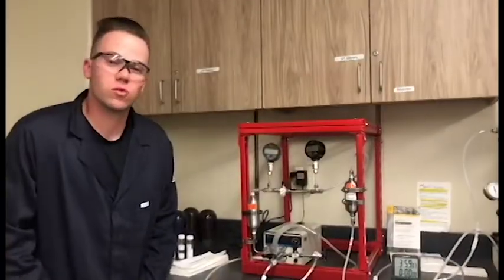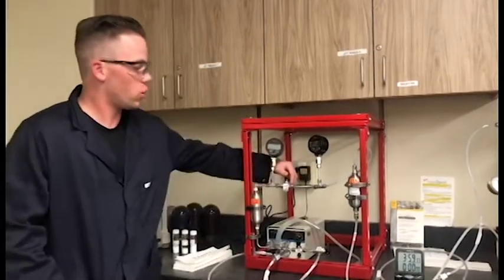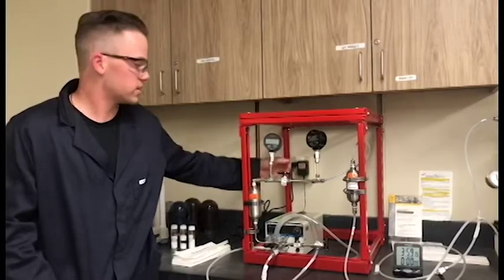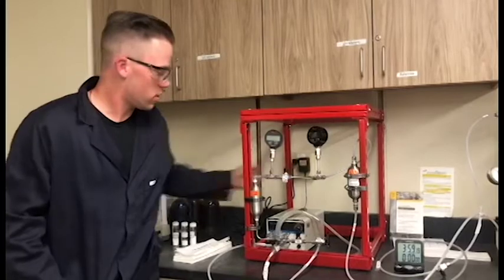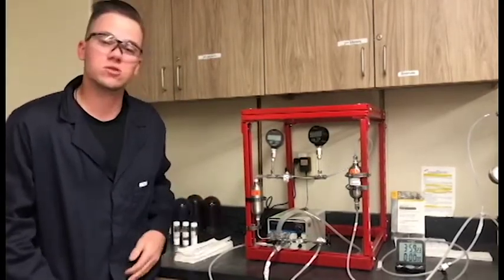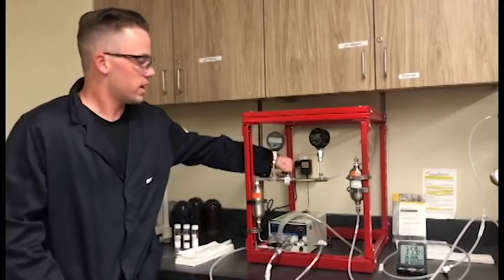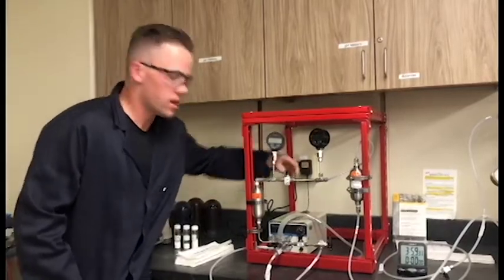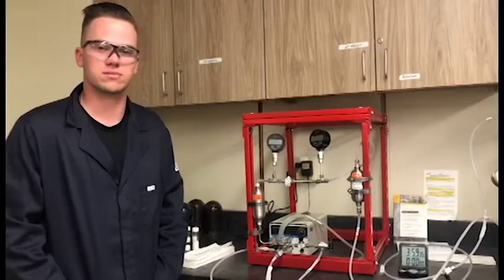For this procedure, we will begin by pressurizing the C2 cell. Upon pressurization, we will open the valve, equilibrating the two cells. We will measure pressure systematically, and then isolate the C2 cell again by closing the valve, repressurize, and continue at incremental pressures. For desorption, the reverse is true. We will depressurize the C2 cell, equilibrate, measure pressures, isolate the cell again, depressurize, and continue at decreasing systematic pressures.